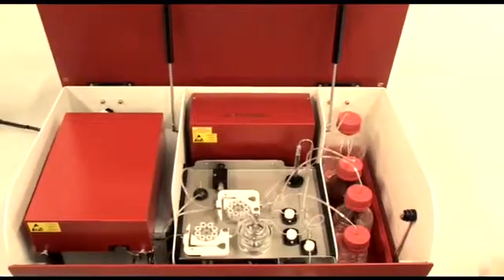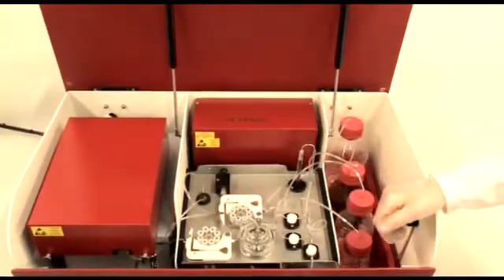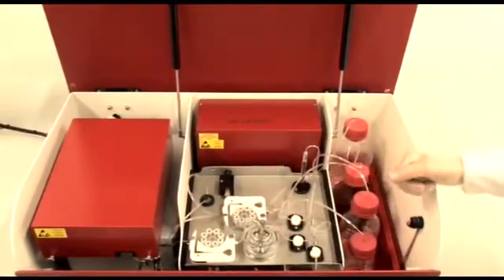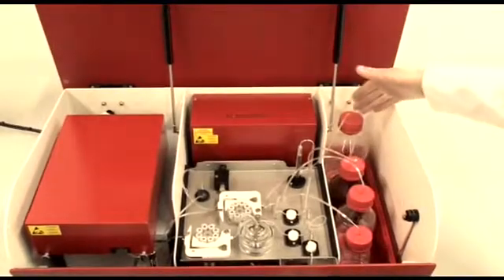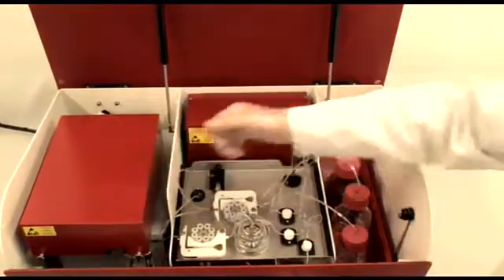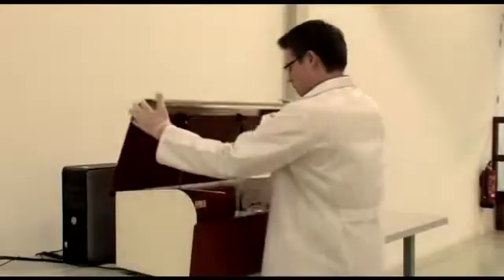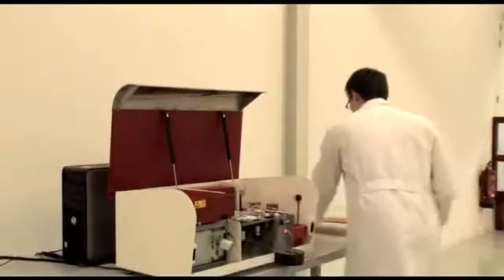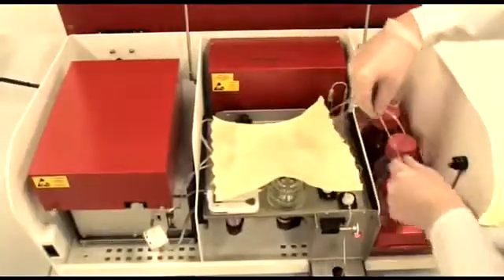How does it work? There is a sample preparation unit where milk and a staining solution are combined, after which they are transported to the optic unit for counting. For daily use there are four liquids in the SomaScope Smart that are easily removed, cleaned and filled.